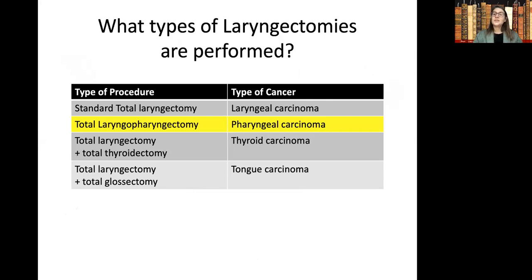Okay, so moving on to our second most common type of laryngectomy, which is going to be our laryngopharyngectomy for pharyngeal carcinoma.